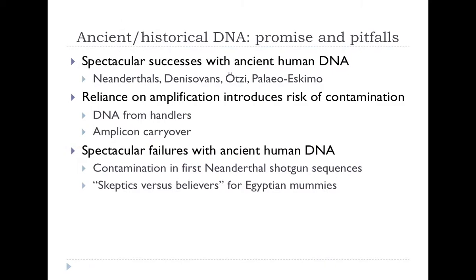Okay, so that's one example where we've been pushing the boundaries and seeing if we can make these techniques work for us in the diagnostic arena, in the clinical microbiology arena. I'm now just going to step to one side from clinical microbiology of existing people, and focus for a little bit on ancient and historical DNA. There's been a great deal of interest in getting DNA out of old material, museum material, archaeological material, and so forth. And there have been some spectacular successes.